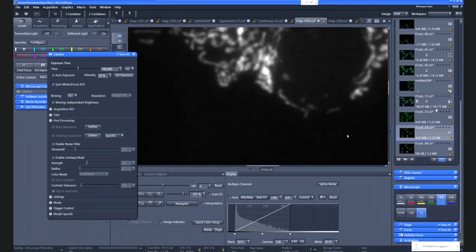Super. Maybe I can add one really last final question, which I think fits right now. What would have more impact on the cell's viability, light intensity or exposure time? Oh, good point. Not so easy to answer.